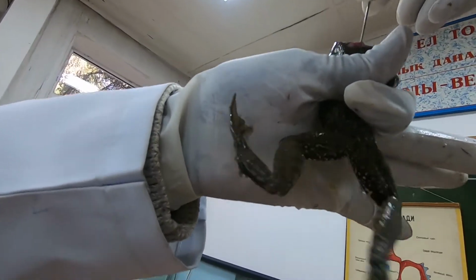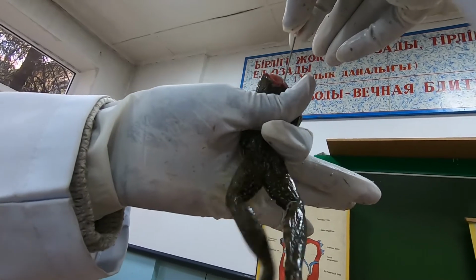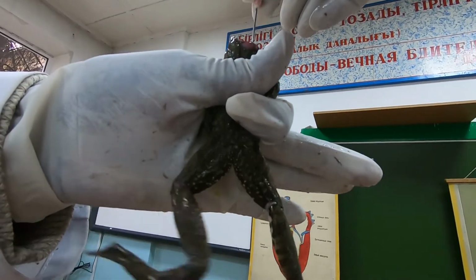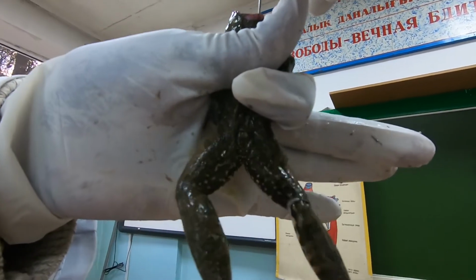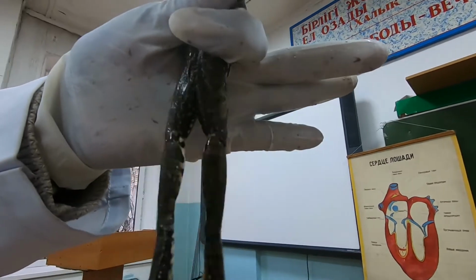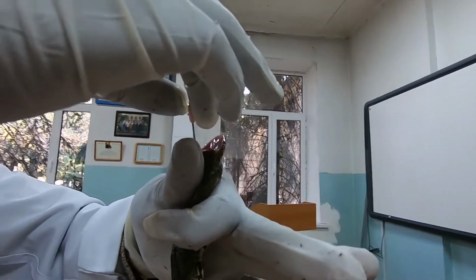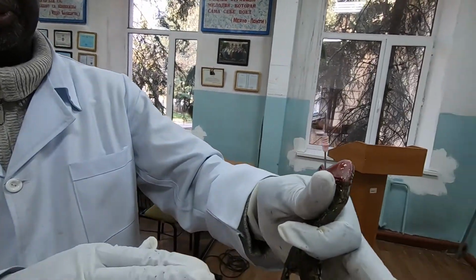Can you see it? Now we're paralyzing the central nervous system. Okay, that's it. You see, it doesn't want to die, but it is still alive. We're just paralyzing it. The heart is still beating.